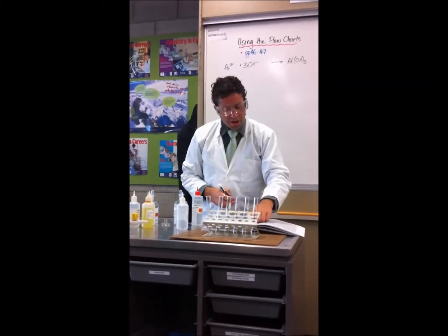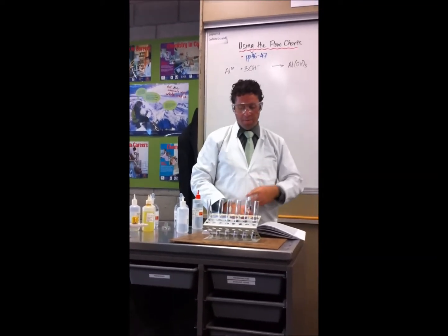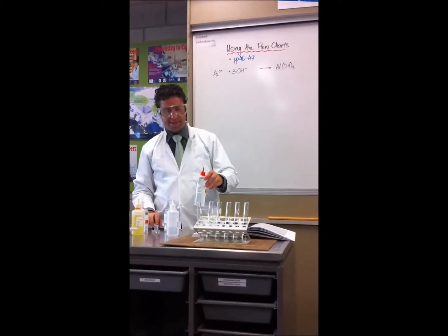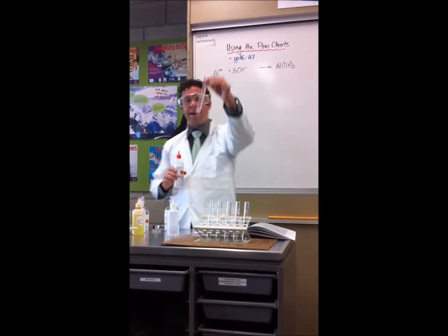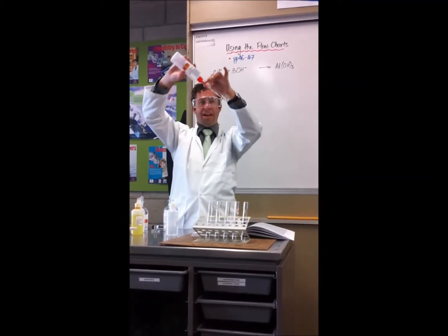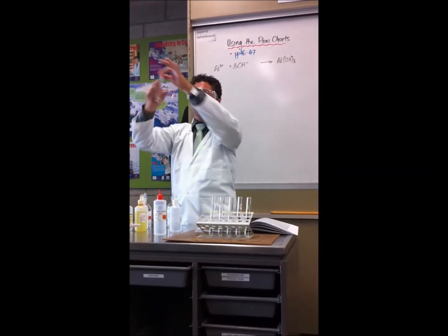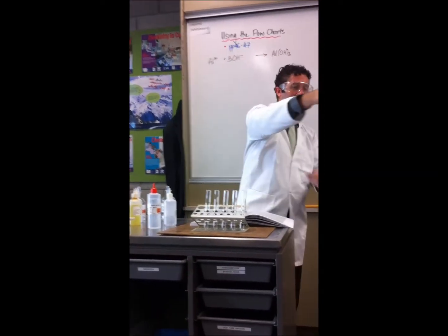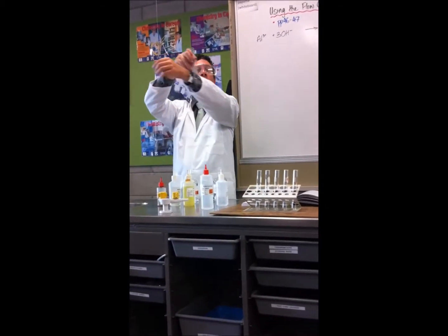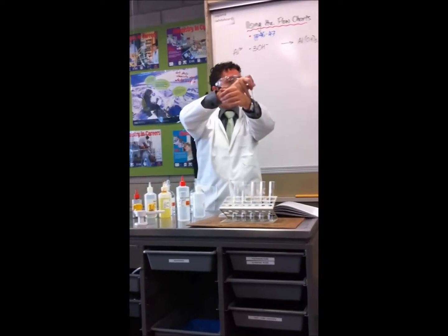The next question, if I go down here, it says white precipitate. It is lead or aluminium or zinc or magnesium. It now says to add excess. So what that means is you're basically going to double the volume of what's in there. So add excess sodium hydroxide, and this isn't a dilution, it's actually gone completely clear now. Okay, you can see that there's no cloudiness in there anymore. So what we say is that the precipitate disappeared or redissolved.